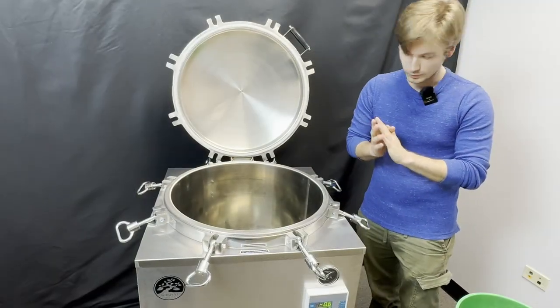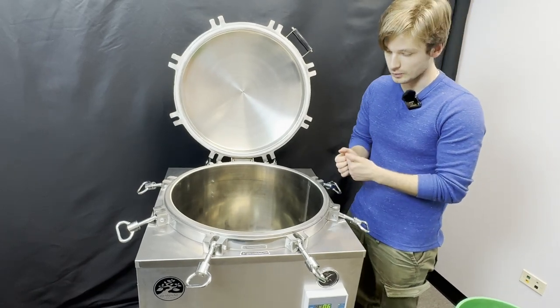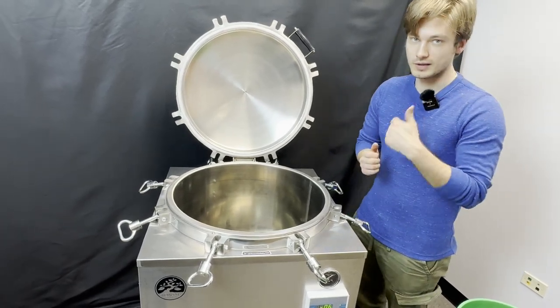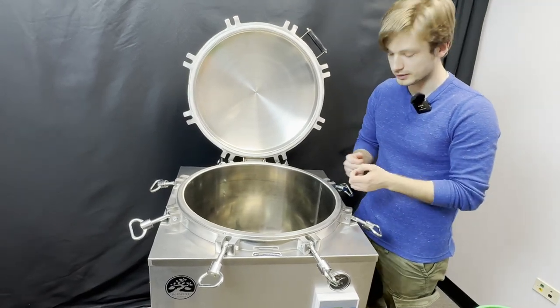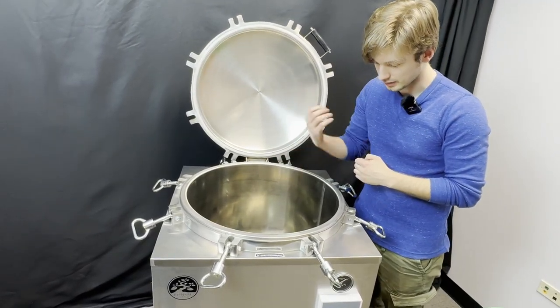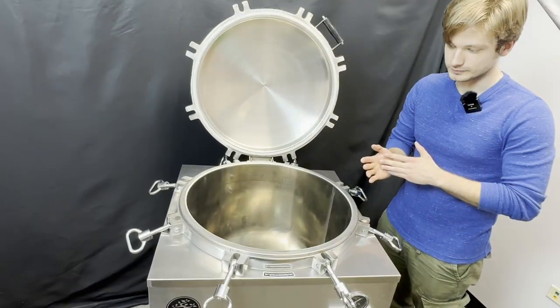When filling up your autoclave with water, make sure you're using the right type of water — either reverse osmosis, distilled, or filtered water. This helps prevent mineral buildup on your heating elements and helps extend their lifespan.